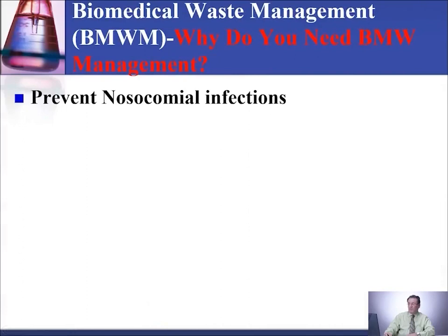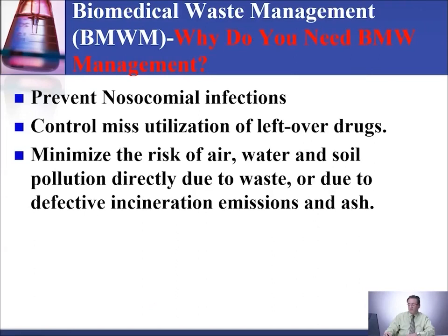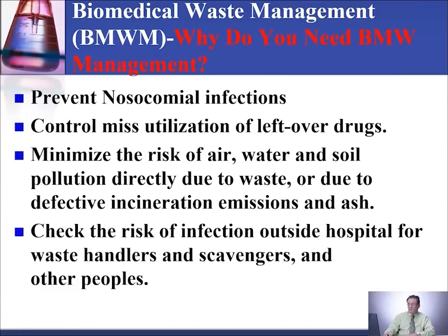Why do we need BMW management? To prevent nosocomial infections, to control misutilization of leftover drugs, and to minimize the risk of air, water, and soil pollution directly due to waste or due to defective incineration, emissions, and ashes. And to check the risk of infection outside the hospital for waste handlers and other people.